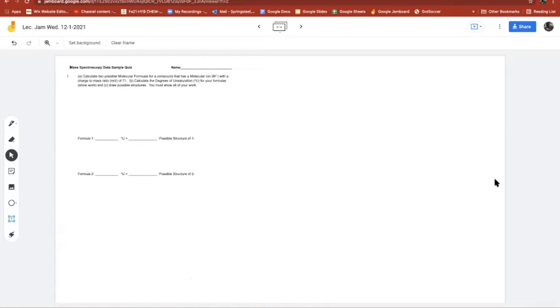If it's an odd molecular ion, it's probably got an odd number of nitrogens. And odd number of nitrogens, we're going to usually just go with N, with 1. That's odd. So with nitrogen, I like to do rule of 13 on the full 71 and then add the nitrogen later, like I do with oxygen. But with bromine, since bromine 79 is so big, I usually subtract the bromine out at the beginning. You could subtract the nitrogen 14 from 71 right now, but I'm going to do it the way I usually do it. 13, I'm going to see how many CHs are in this.